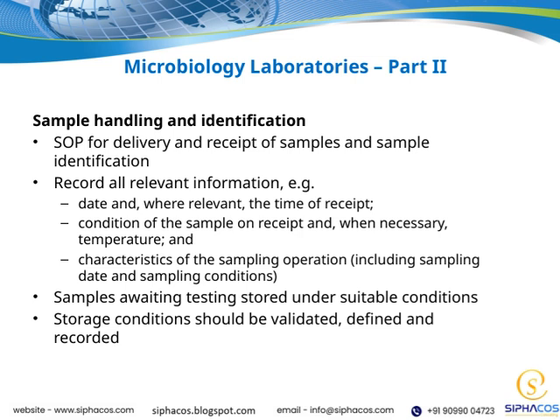Once samples are received, they should be stored under suitable conditions to prevent any deterioration or contamination. Remember, storing samples properly isn't just good practice. It needs to be validated, meaning the storage conditions must be tested and confirmed to maintain sample integrity. These conditions should be clearly defined, recorded, and consistently applied.